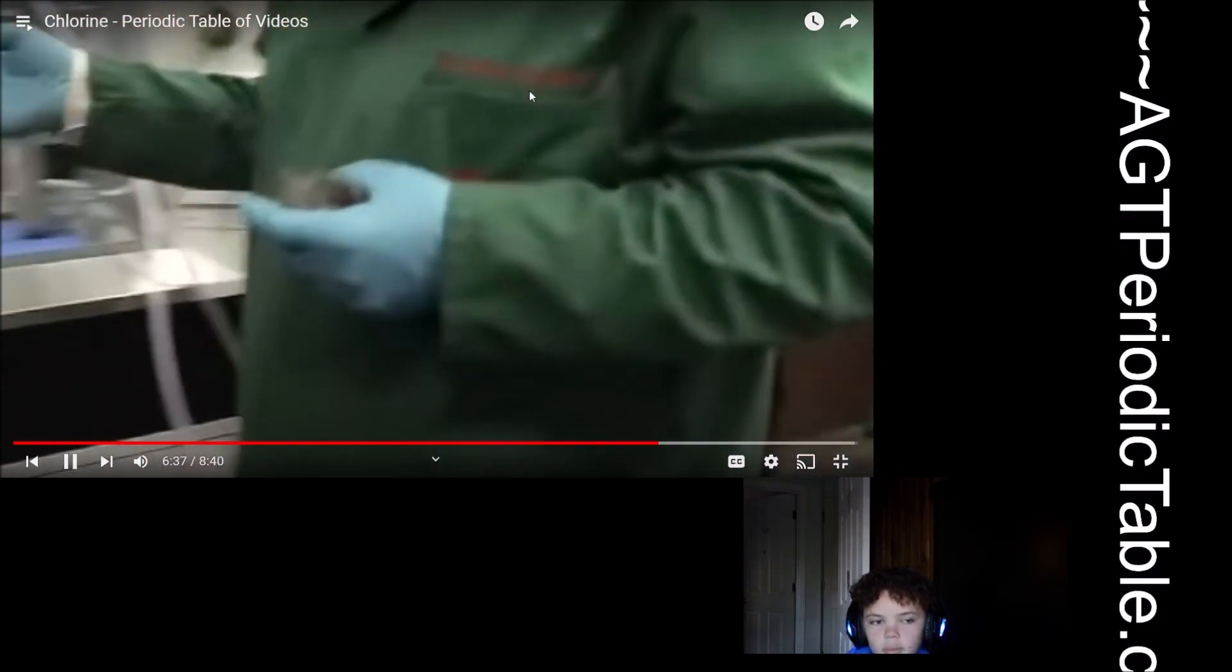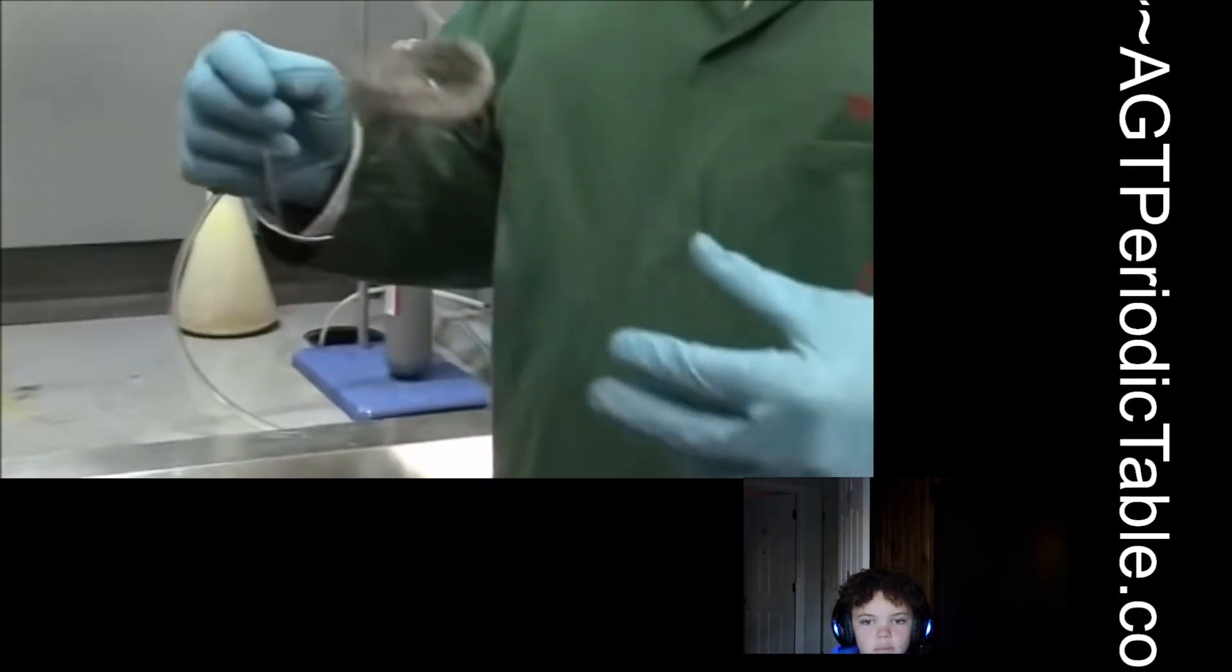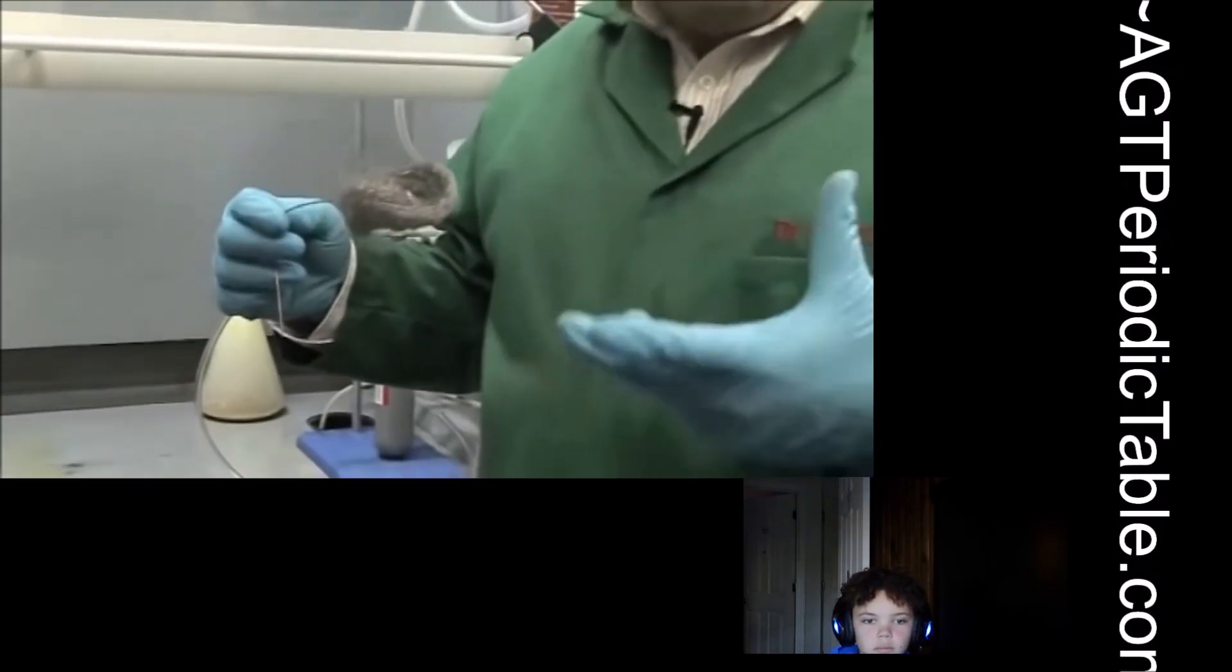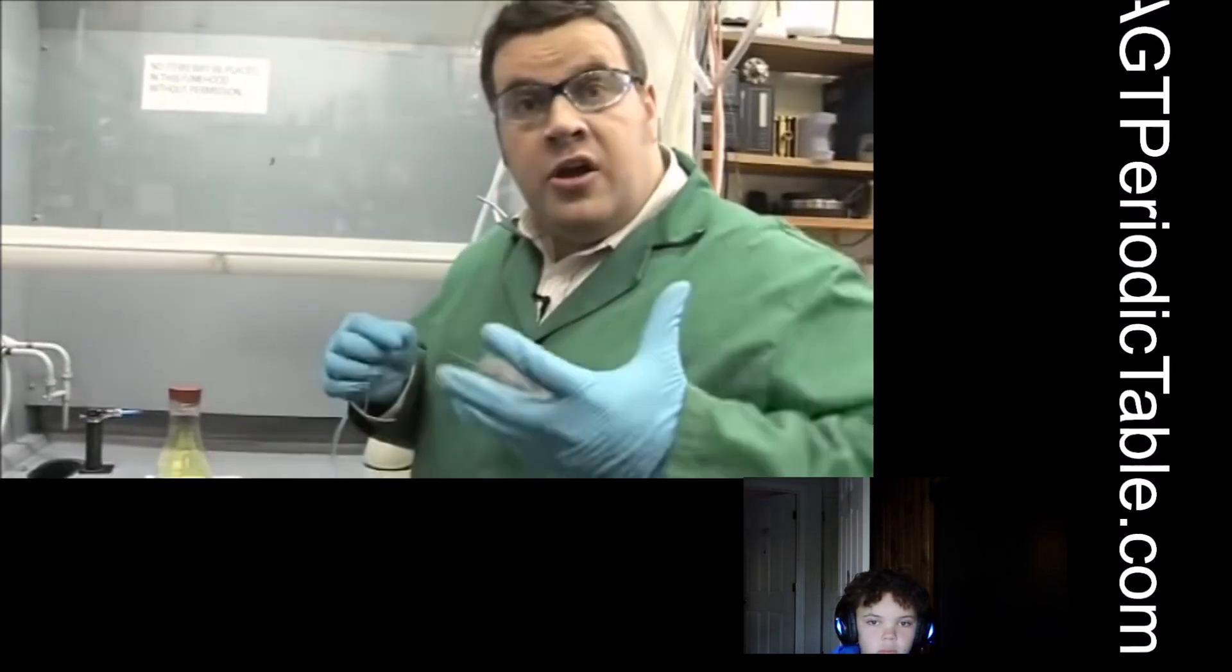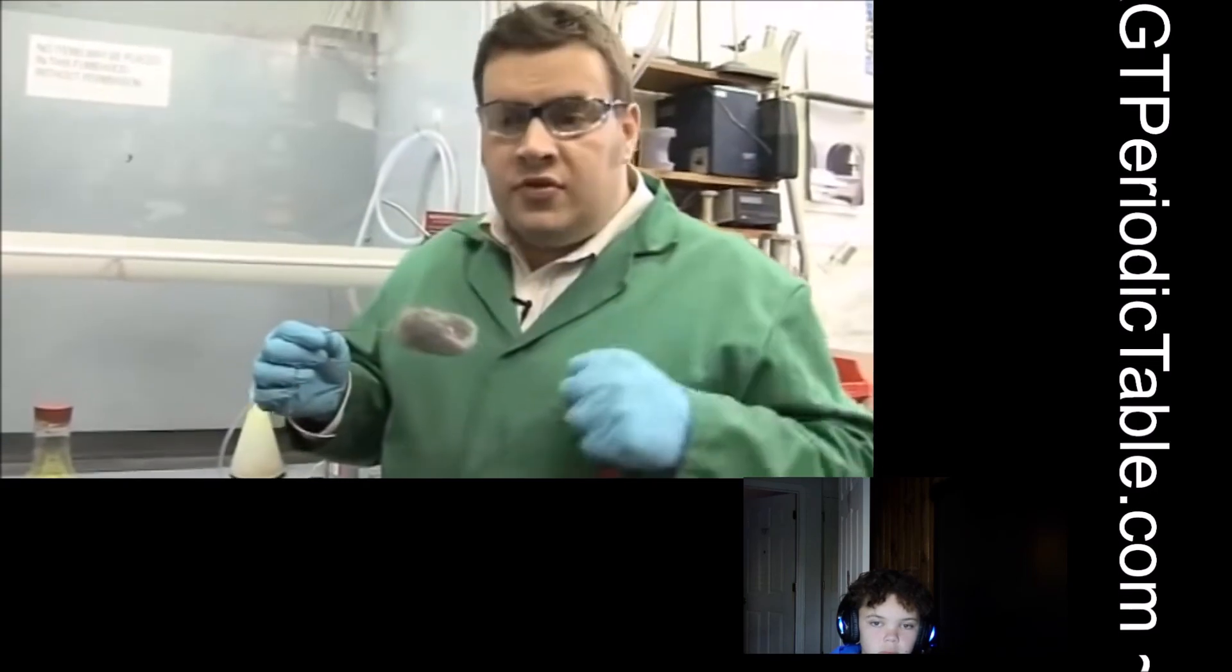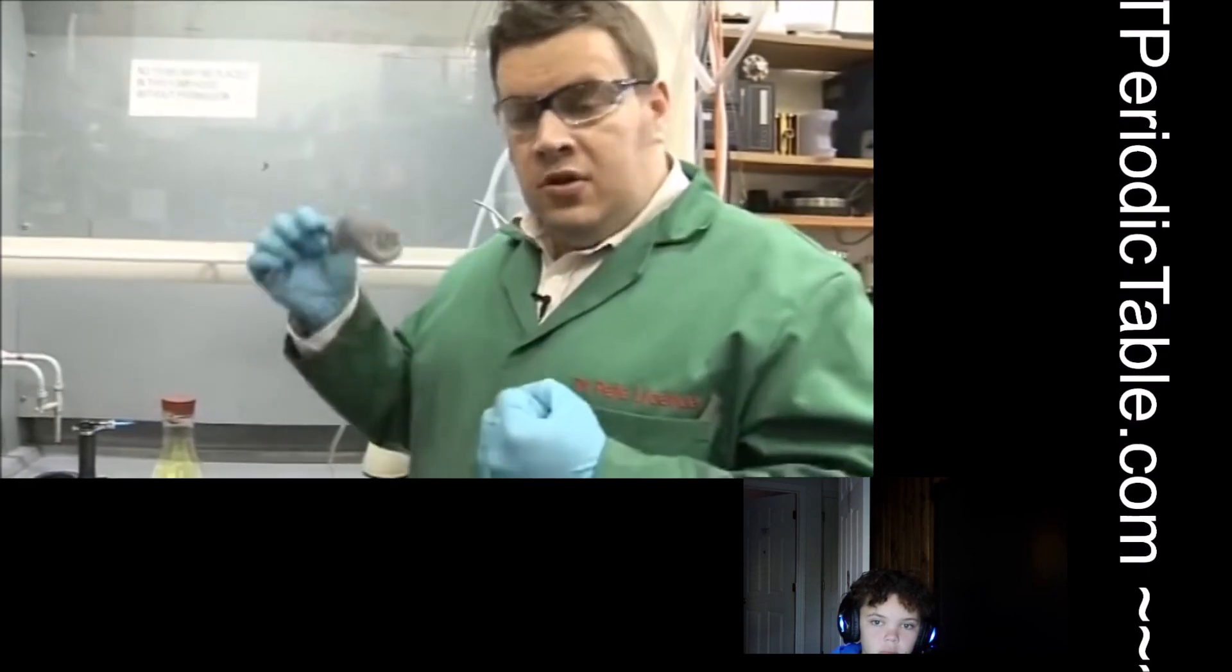So we've got some chlorine in this flask and you can see the nice yellow colour. And I thought what we'd try and do now is do a competition reaction again or a reaction with iron. So now the iron, we're going to heat the iron. This is iron wool, which you might use for treating wood. And we're going to heat that till it's warm and put it in the chlorine. The chlorine will oxidise it to iron chloride.